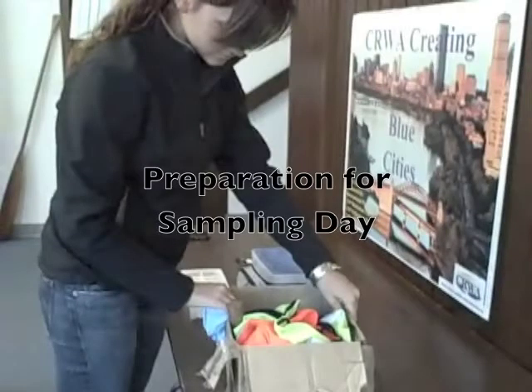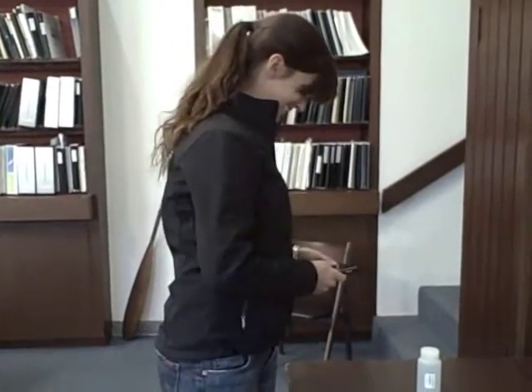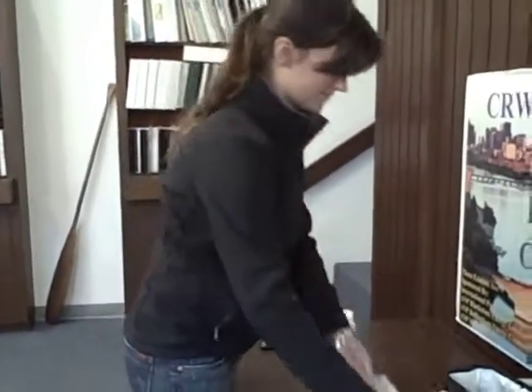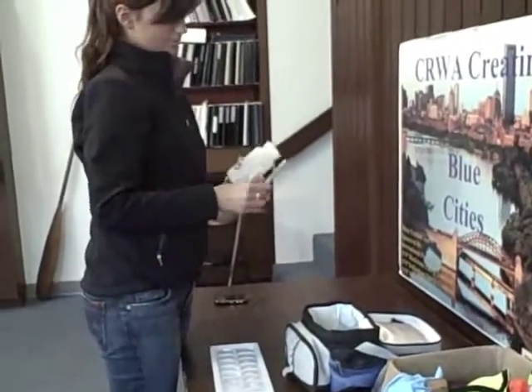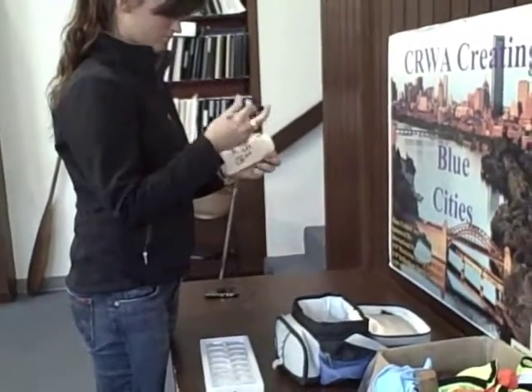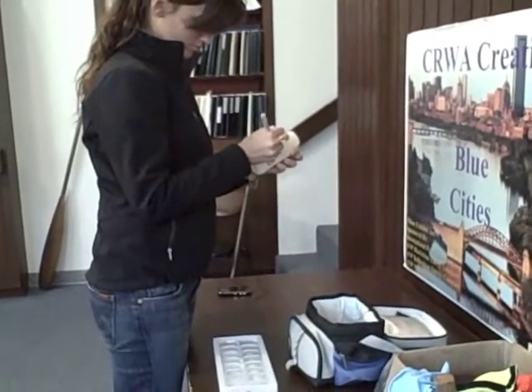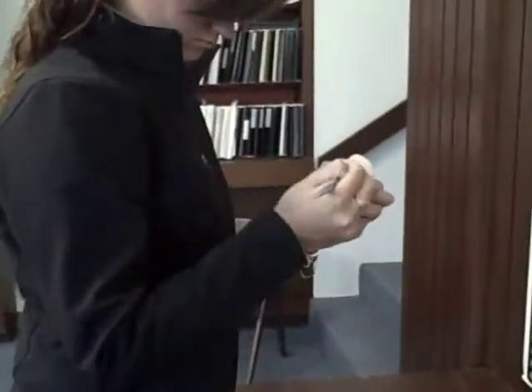This section will review sampling preparation and things to remember before sampling day. Before the morning of sampling, please get in contact with your sampling partner and verify arrangements for exactly where and when to meet. You'll also want to make sure you prepare ice so it will be ready to go the following morning. It's also a good idea to locate all your sampling bottles well ahead of time. This way you can request more bottles if they're missing, or fix the label with a permanent marker if the site ID or date are starting to wear off.